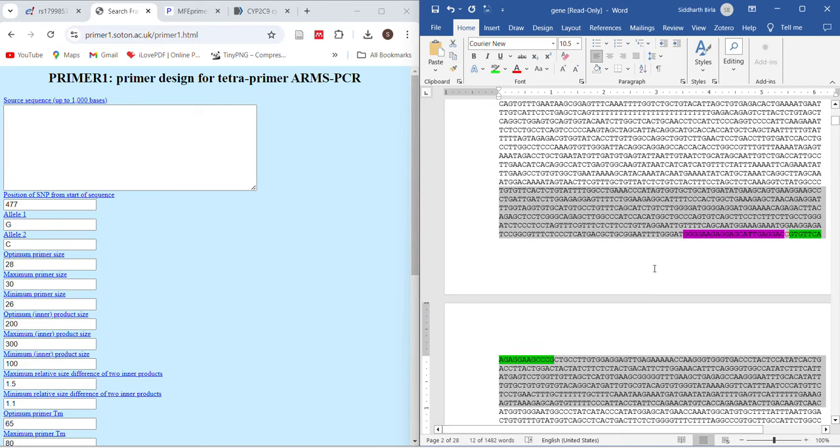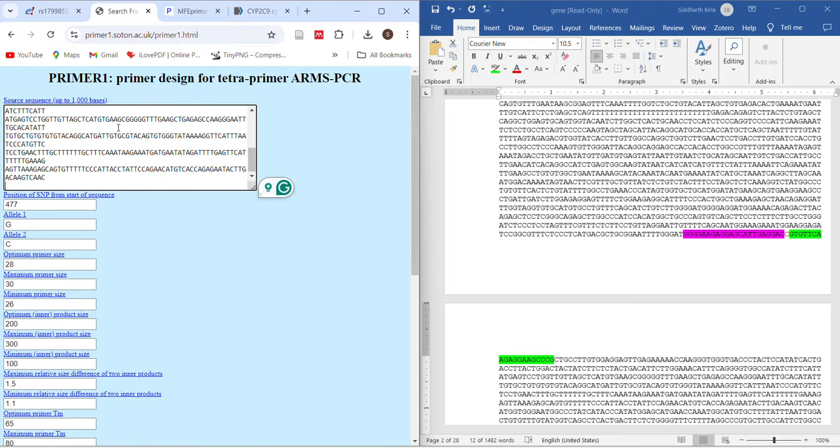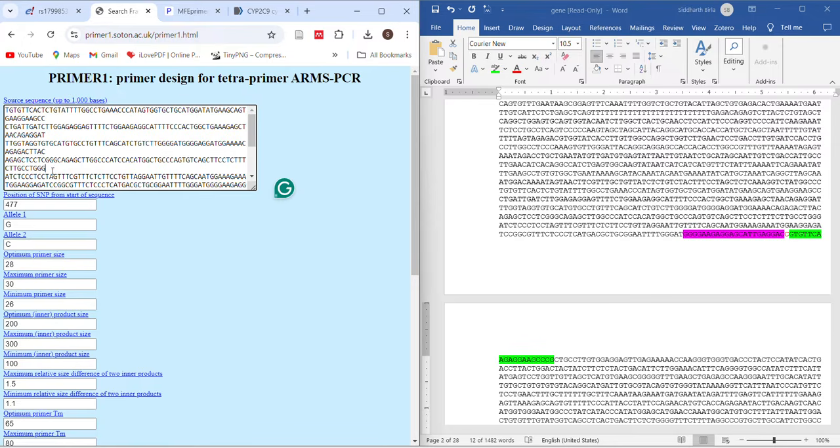So I'll just copy it, control C. Now I'll paste it in the software, control V, right? So now it is showing me some spaces, right? So I need to fill these gaps. Just place your cursor, press the delete button, and that's it. So it will take hardly 2 minutes. It happens sometimes, not all the time. Okay, so I'll just check it. Okay, some more are there.